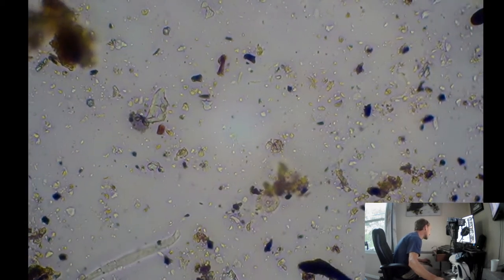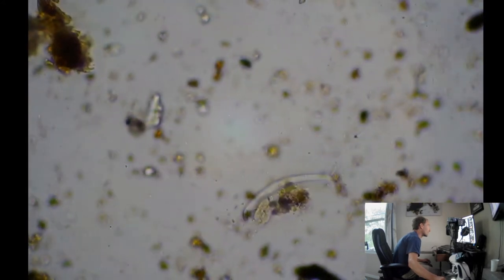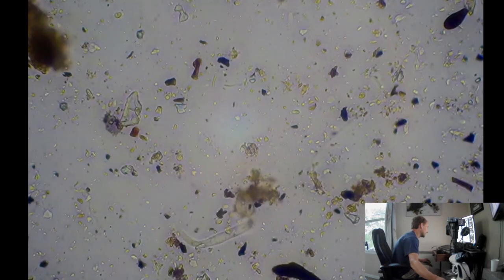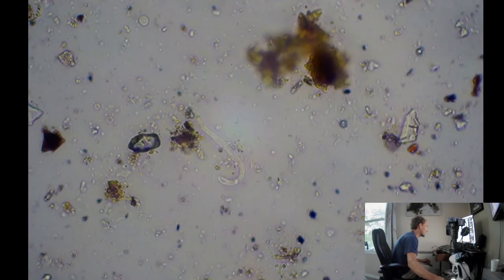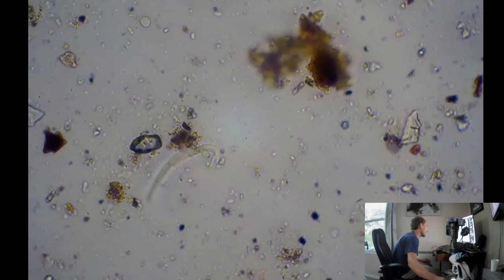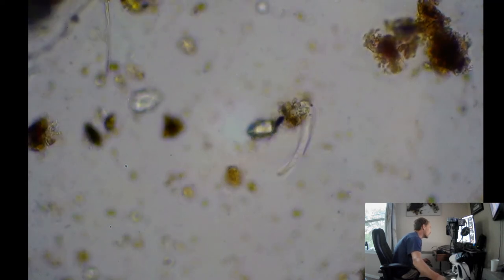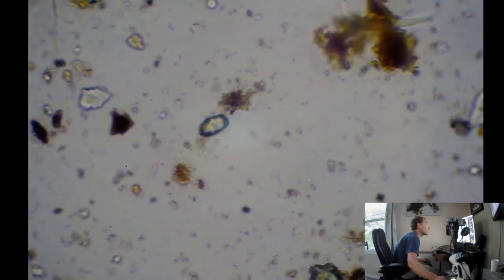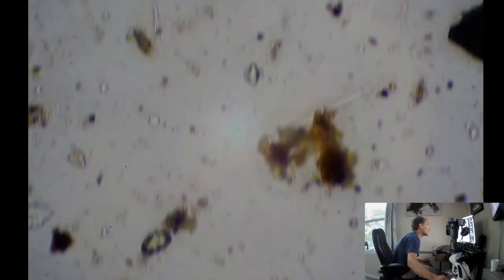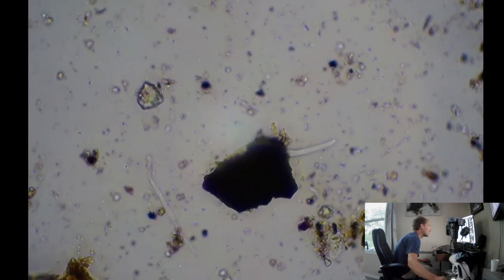Just in focus. There you go. Yep. Good aerobic microorganisms. That's what we want to see. It looks like he's got his tail pinched off. Maybe there's some bigger predatory nematode eating nematodes in here. But this guy, I'm pretty sure from the way he's moving and the way his mouth looks, he is a bacterial feeder. Just going around there, eating up the bacteria. I don't see any spike or anything in his head that would be used to punch into a fungi or a plant root.